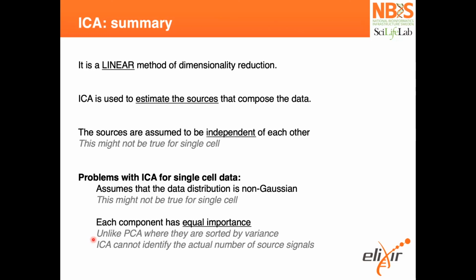Right. ICA is also implemented in some packages, for example, Seurat, I'm sure it is there. For Scanpy, I'm not sure, and for Scran it is not there, but you can also run it independently as well.